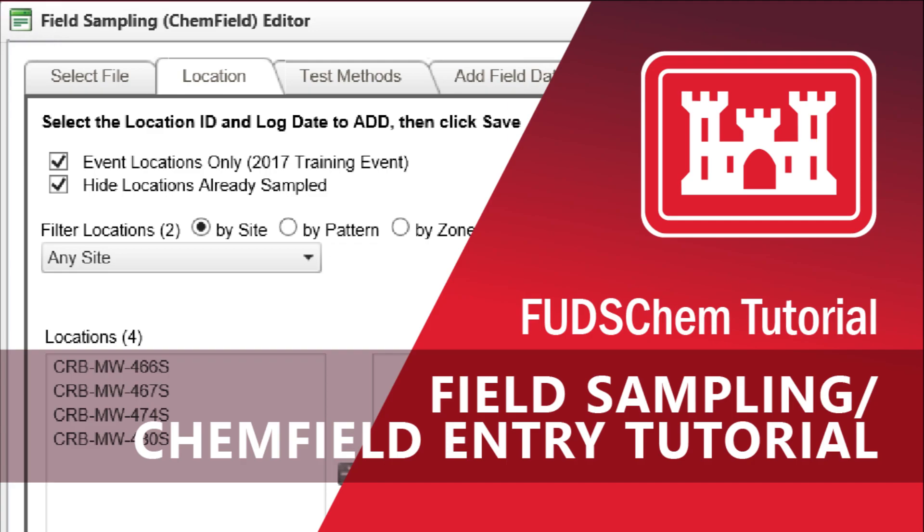We will also go over how to generate pre-populated CoCs and bottle labels to take into the field.